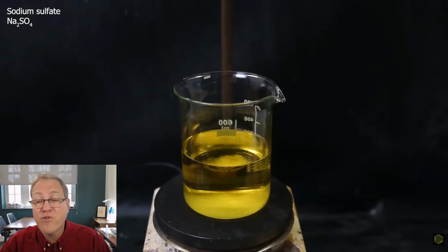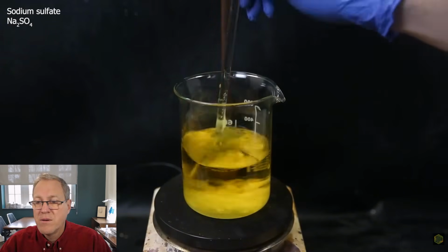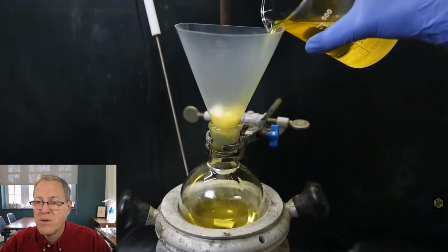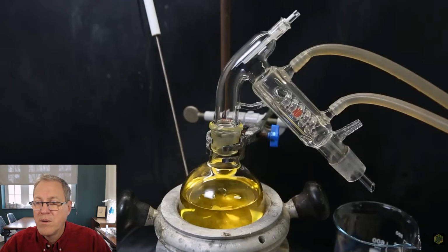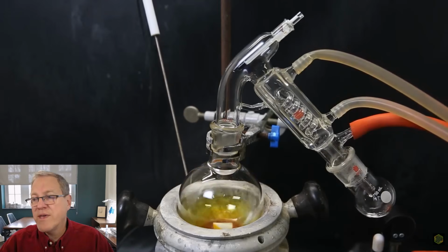He's going to throw in some sodium sulfate to dry everything. To this, I add some sodium sulfate to absorb remaining water. I'm kind of a magnesium sulfate kind of guy, but sodium sulfate does work okay. I then set up a flask with a funnel and filter the solution through some cotton. I wash it out and down with some fresh ether, and then set the solution up for distillation to remove all the ether. When it's almost all gone, I attach a flask and pull a vacuum to make sure all the ether is gone. So now he's evaporating off the solvent.